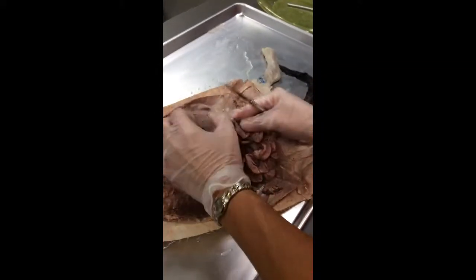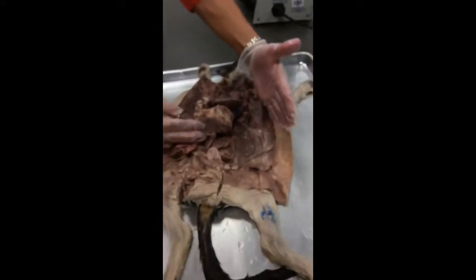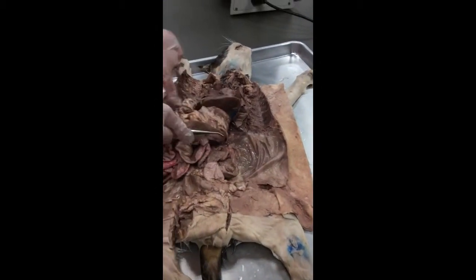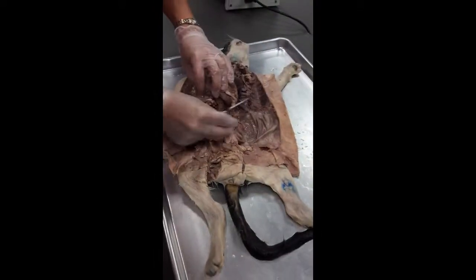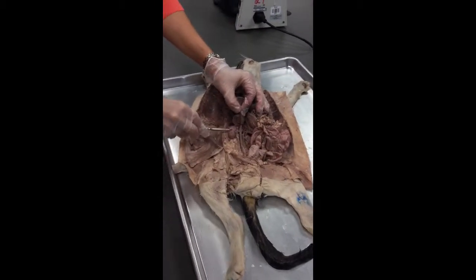Oh, one organ over here. Theirs is kind of small, but what is this? Spleen. And then we got the kidney. Spleen right there. And it's always going to be on the left, lateral, and it goes down more inferior than the human does. Which one's the spleen? That's the spleen. Oh, I see. It's a similar color to the lung, but it's flat and goes down the side. Then if we lift that up, we'll go this way. Then what is this? Kidney.